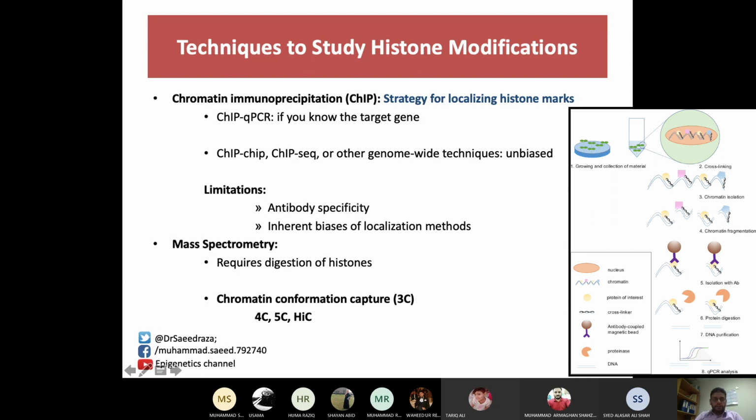So in this case, you could say that this is the chromatin immunoprecipitation, because you are focusing on the chromatin aspect of this overall thing. So you could couple this technique. Once you have done this chromatin immunoprecipitation, you have an antibody against chromatin, any chromatin.